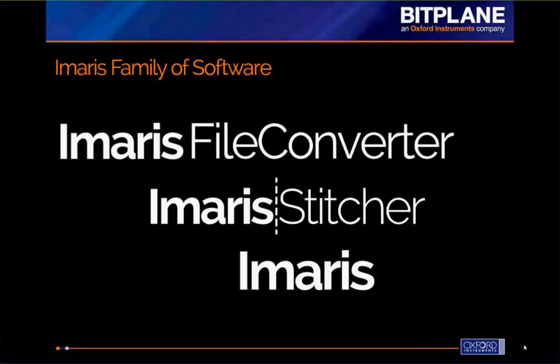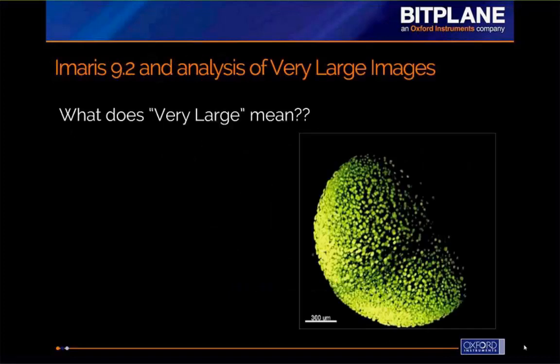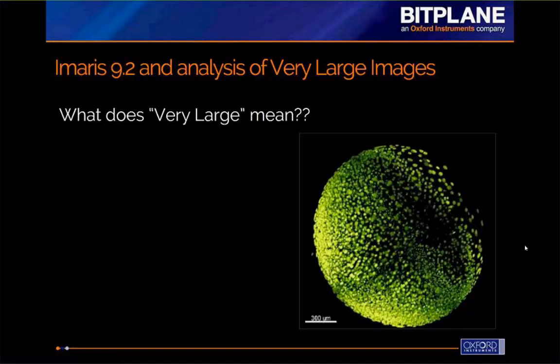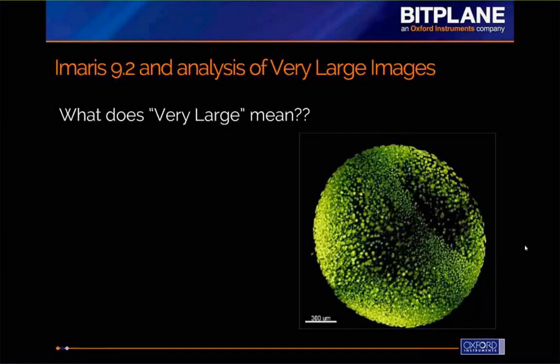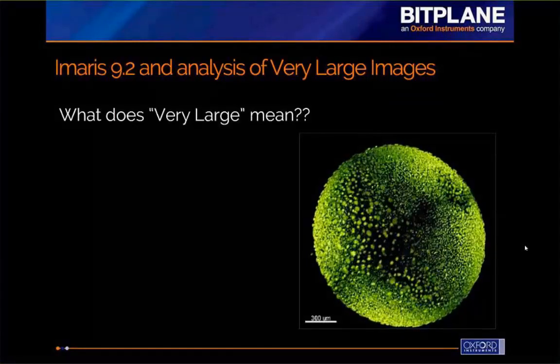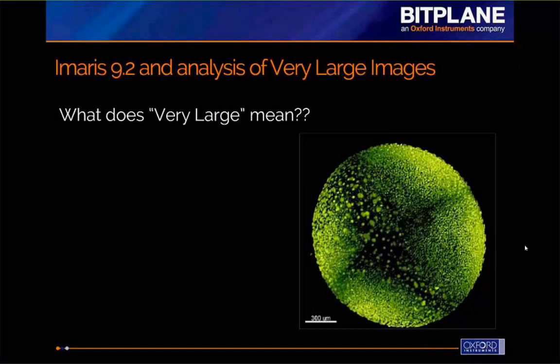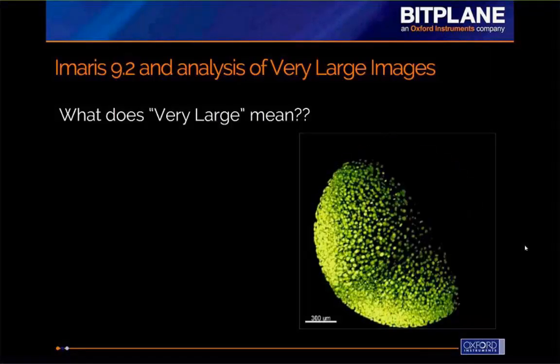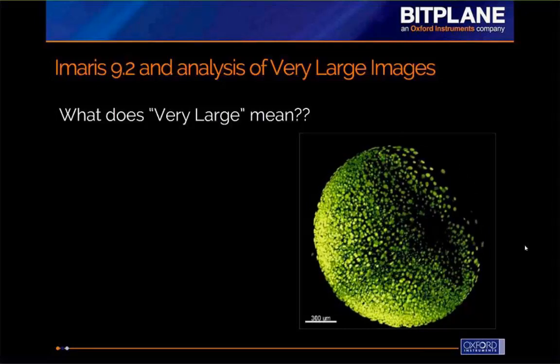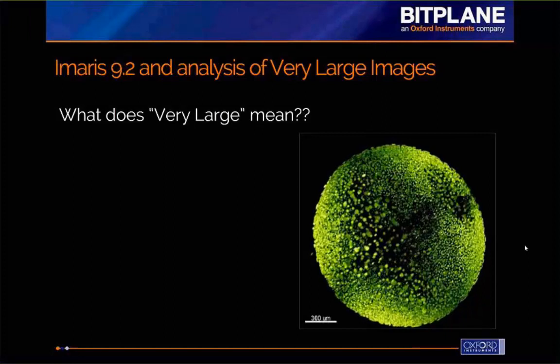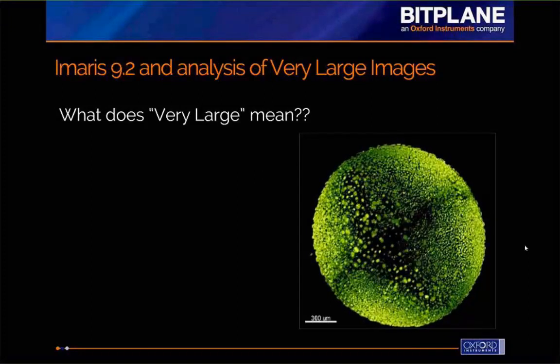I've been saying 'very large images' repeatedly, so what does 'very large' mean? It means different things to different people. For example, this time-lapse from a light sheet microscope of a zebrafish embryo is about two terabytes in size — certainly large by most standards. But 'very large' can also simply mean an image that's bigger than the amount of RAM on your system. In those cases, you will see a significant speed increase when using spots and tracking algorithms.